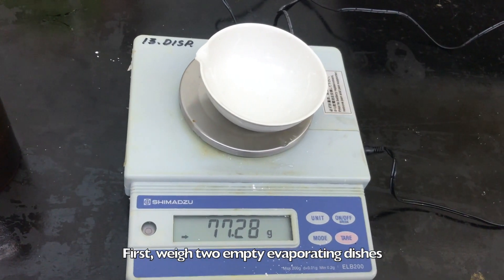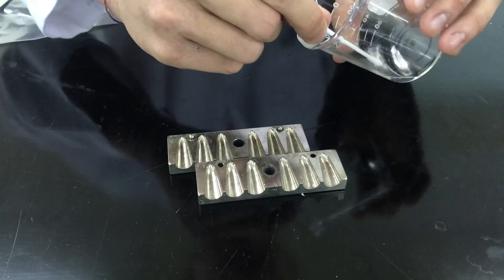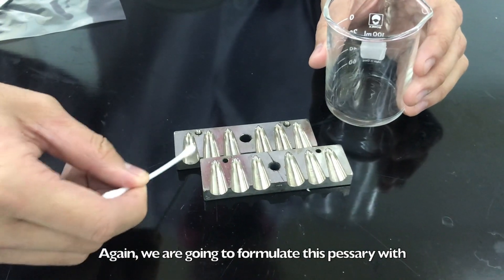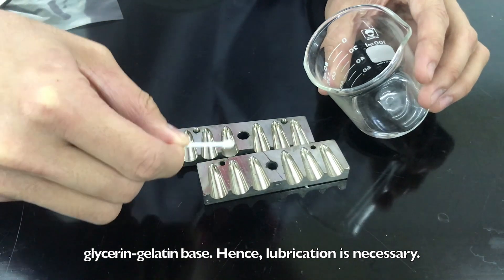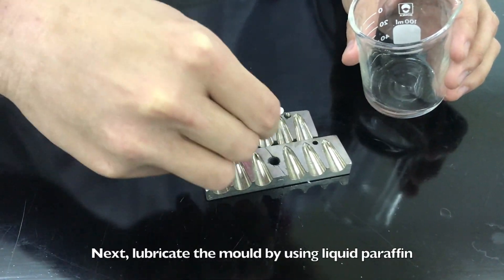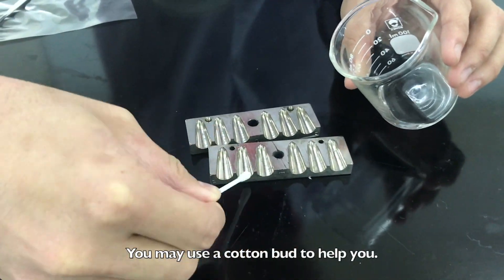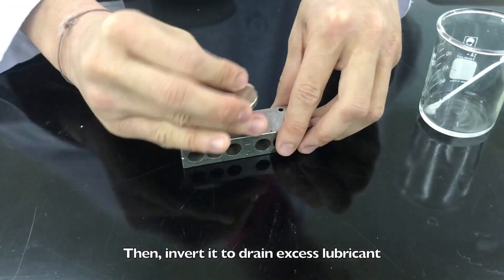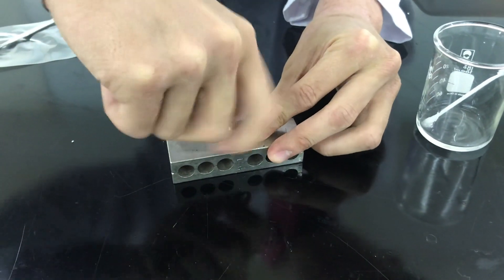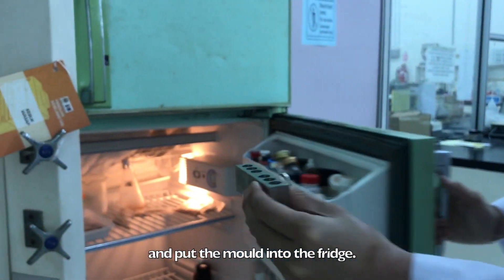First, weigh 2 empty evaporating dishes and record the readings. We are going to formulate this pessary with a glycerin-gelatin base, hence lubrication is necessary. Next, lubricate the mould by using liquid paraffin — you may use a cotton bud to help you. Then, invert it to drain excess lubricant, and put the mould into the fridge.